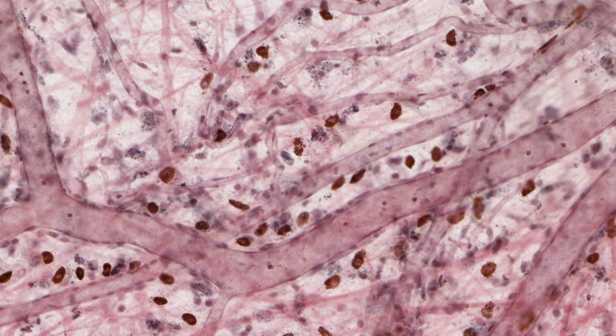These long interconnected profiles are blood capillaries, and you can see in some areas the pale stained nuclei of the endothelial cells. Only the histiocytes accumulated the trypan blue to any appreciable extent, so this procedure demonstrates a clear-cut functional difference between the macrophage system and any other population of cells.